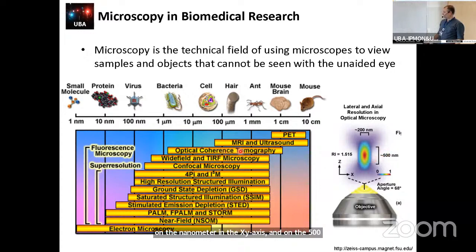We have several technologies that can reach this limit of resolution. For the last 15-20 years, we started to overcome this diffraction barrier with super resolution techniques that enable us to go to tens of nanometers, and nowadays to nanometer resolution. We will learn more about these new techniques on Wednesday.